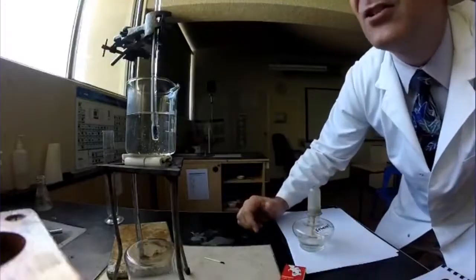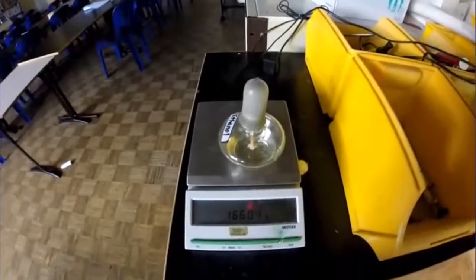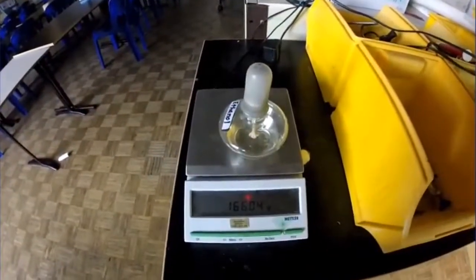You can see that the temperature of the water has now risen to 48 degrees. That's the highest temperature that I can see. So what I need to do now is go and reweigh the ethanol. So here is my value, 166.04.